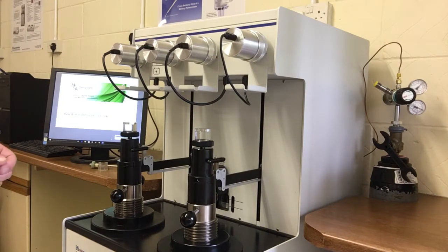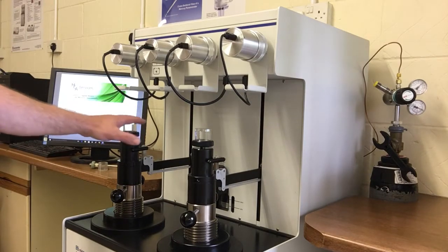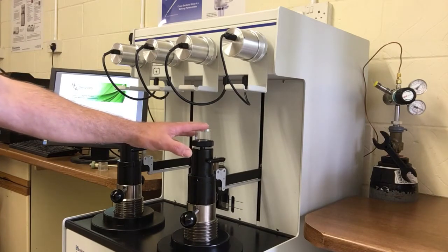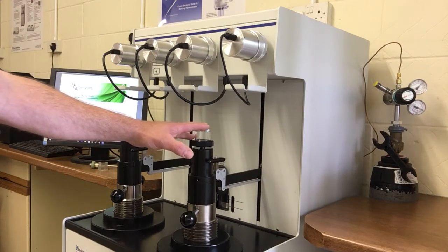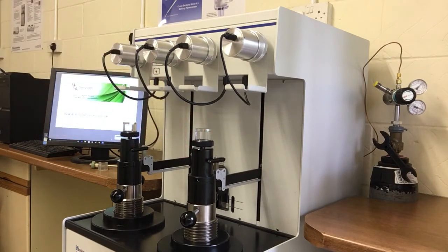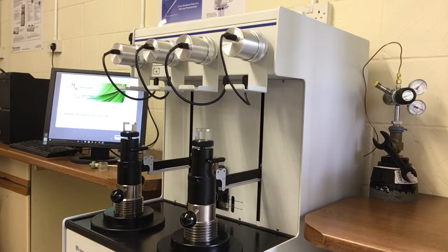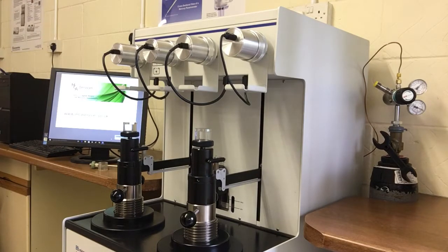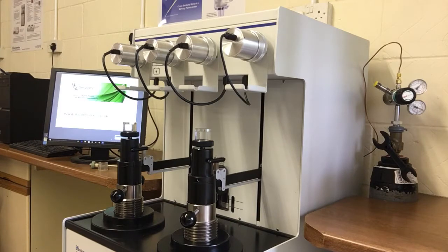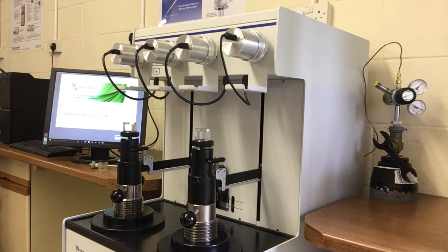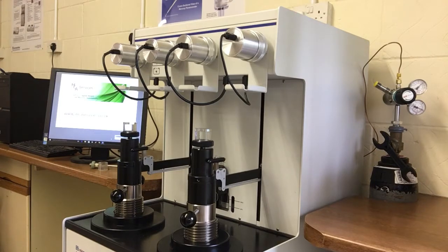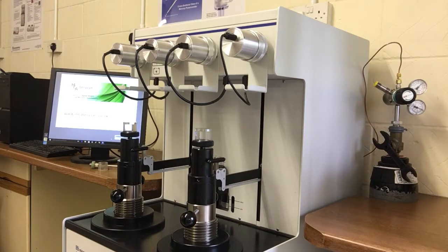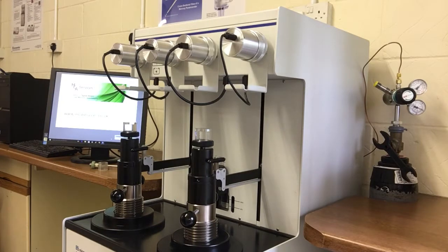The sample is then loaded into one of the high pressure ports and high pressure analysis then takes over. Pressure is then increased from the final pressure of the low pressure analysis up to 60,000 PSIA. And if we want to undertake an extrusion analysis, we will also do that during this stage. It's also worth noting that there's various units of pressure used here and that one atmosphere is equal to approximately 14.7 PSIA.